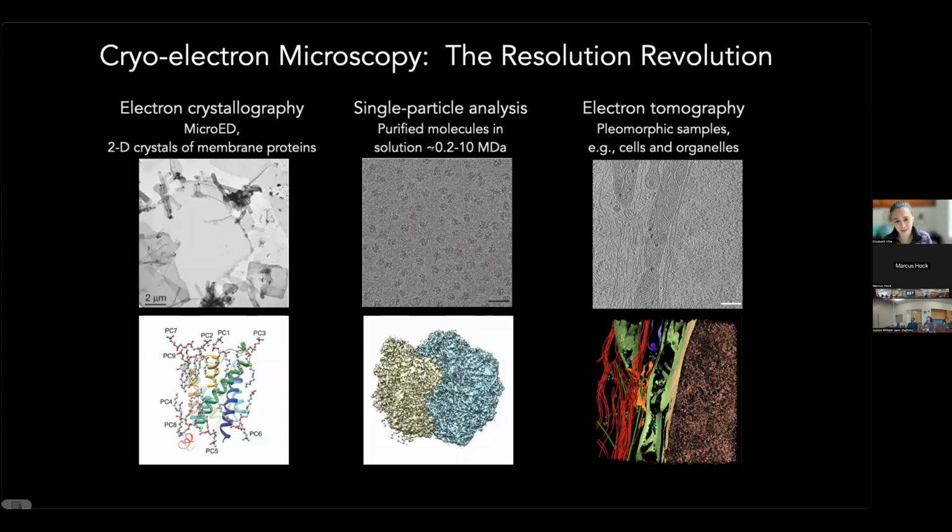If you have a cryo-EM, like we have many on campus, both in engineering and in biological sciences, depending on your sample, you can use the microscope in different modalities.